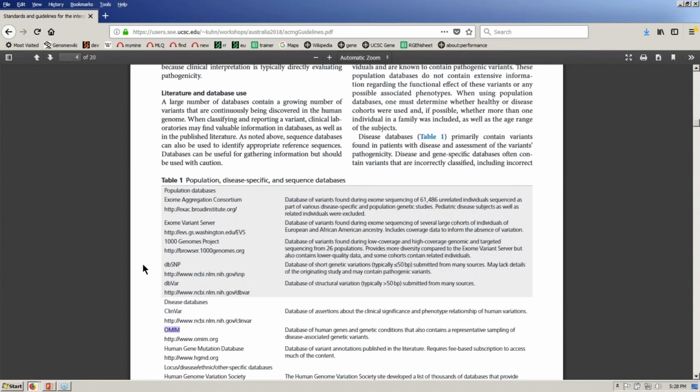So one of the powerful aspects of the browser is the way it brings together data sets from all over the world and all kinds of different projects into one location. So you can see directly on the browser all of these things side by side. And we make it very easy then for you to click back to the original record in the original data set so you can read the details.